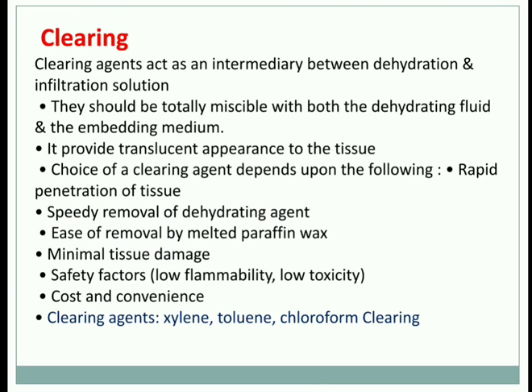It includes rapid penetration of tissue, speedy removal of dehydrating agent, ease of removal by melted paraffin wax, minimal tissue damage, low toxicity, low flammability, cost and convenience. Some examples of clearing agents are xylene, toluene, chloroform.